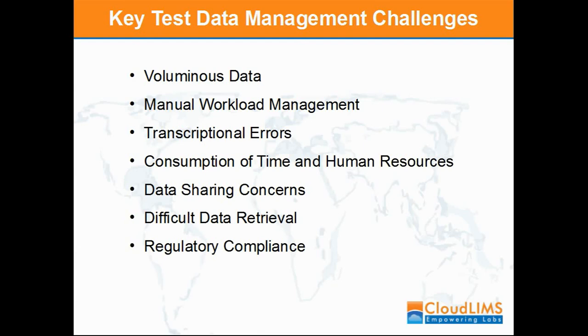Imagine the time and human resource that data tracking would consume along with the data sharing concerns. Besides, data retrieval for reporting, auditing, and collaboration is quite laborious, and its inconsistency in complying with regulatory standards affects the lab's competence in the industry.